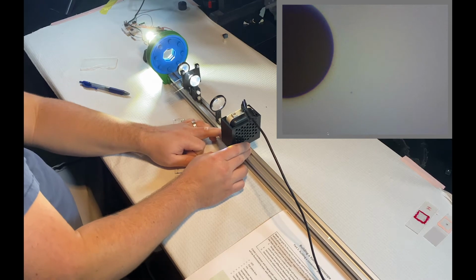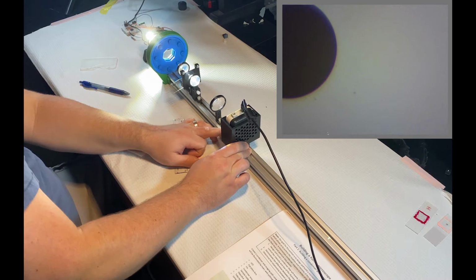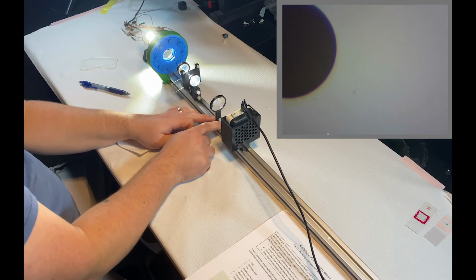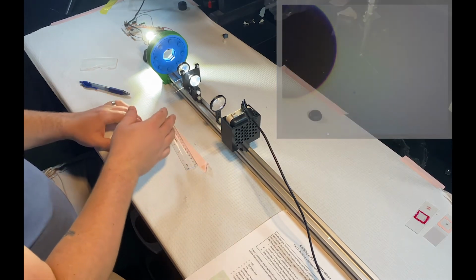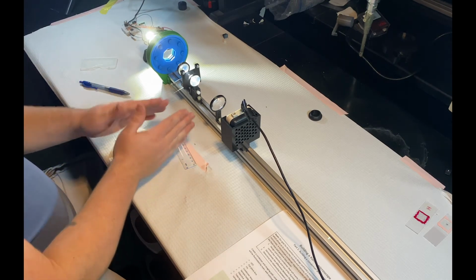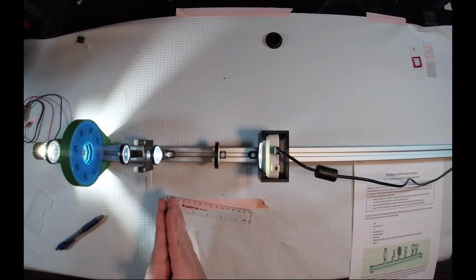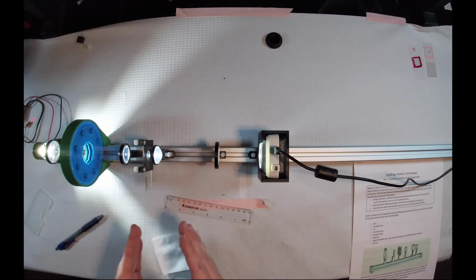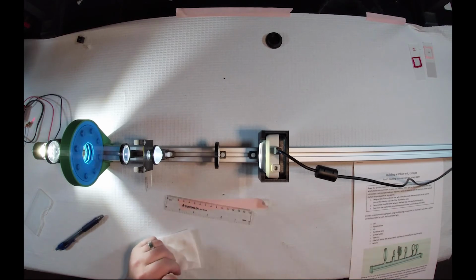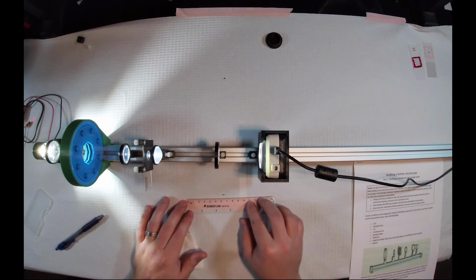And now I will play around a little bit with our camera positioning just to make sure that it's nice and exactly one focal length away. With an infinity corrected system, as I sort of showed you in the last lab, it's very forgiving for even slight misalignments because you do have this space in between these two lenses that is effectively collimated. You don't have an infinite distance between these two that you can play with, but even if it's a few millimeters off, you do get very little reduction in image quality.